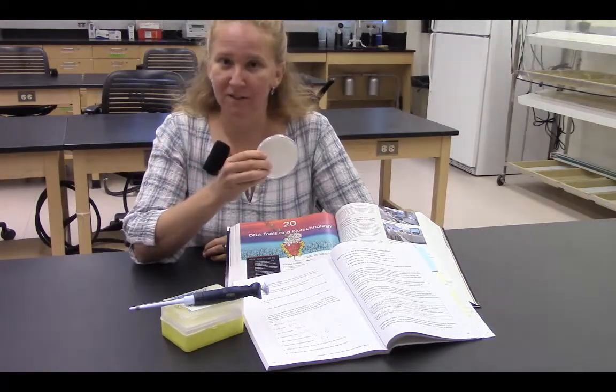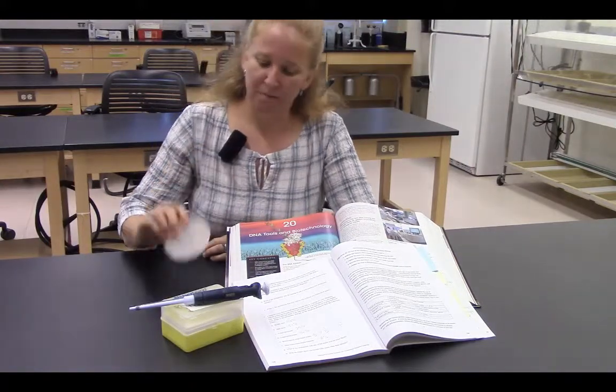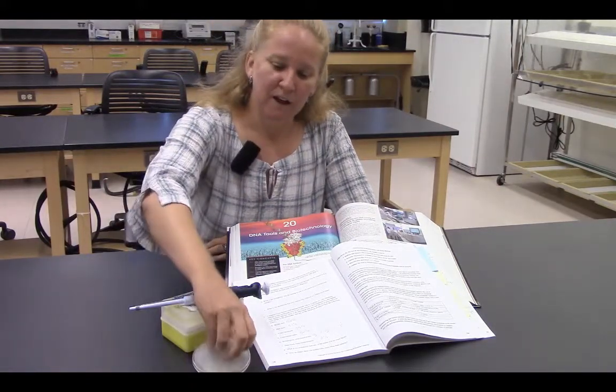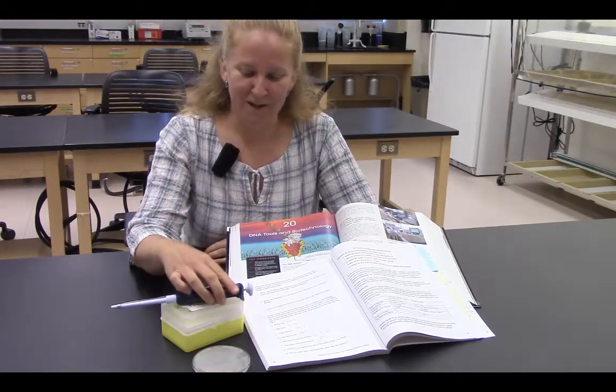You'll be participating in biotechnology and bioinformatics labs that will last several weeks this semester. We'll be working with the nematode worm Caenorhabditis elegans, which we'll be culturing on these plates. The amazing thing about the biotechnology revolution is that we're able to learn a lot about really tiny structures. We've already talked about how to use micropipettes — if you haven't watched that video, watch it — and you'll be using them in lab. They're critical because we're working with tiny volumes of tiny molecules.